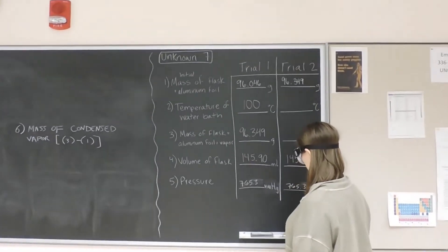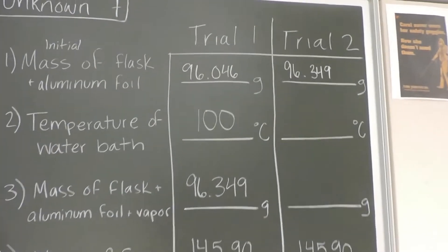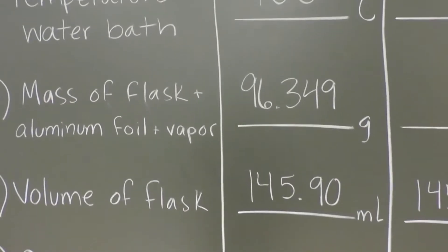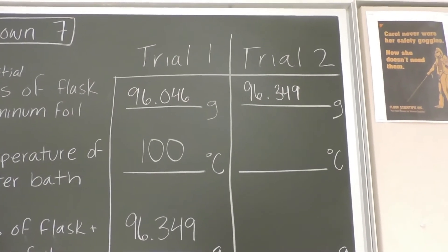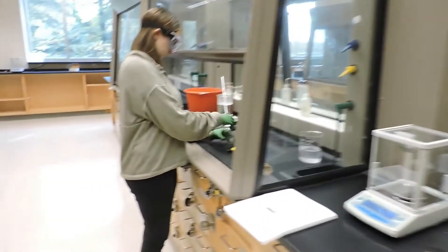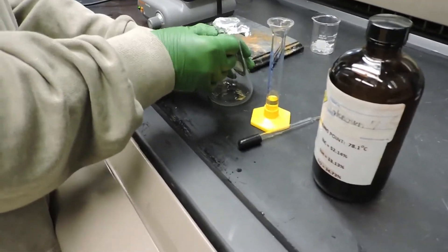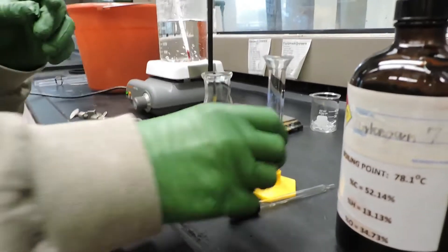For trial two, we're using the same Erlenmeyer flask, so the initial mass of the flask and aluminum foil will be the same as the final mass of the flask, aluminum foil, and vapor from trial one. So we'll start with 96.349 grams. We'll remove the aluminum foil from the top of the flask and then introduce more unknown liquid.